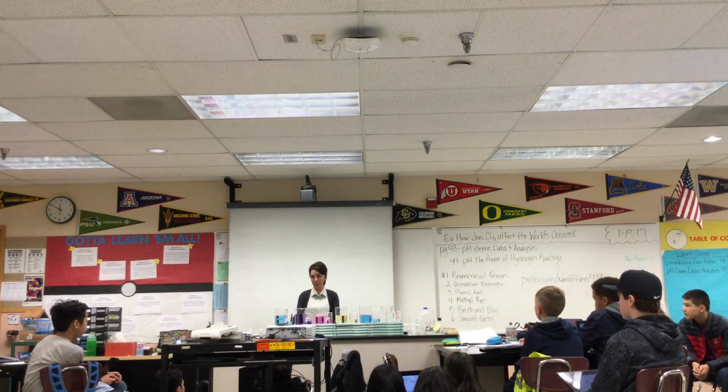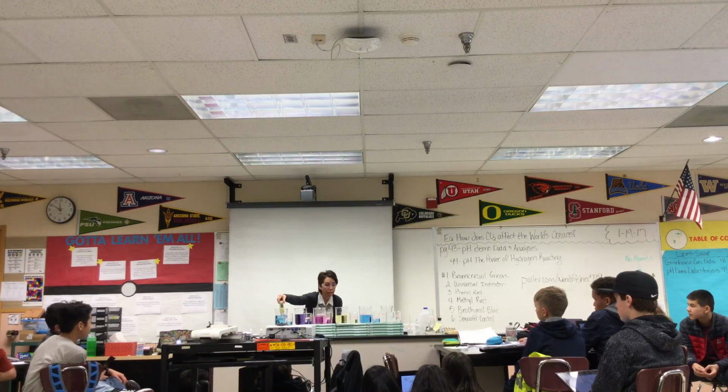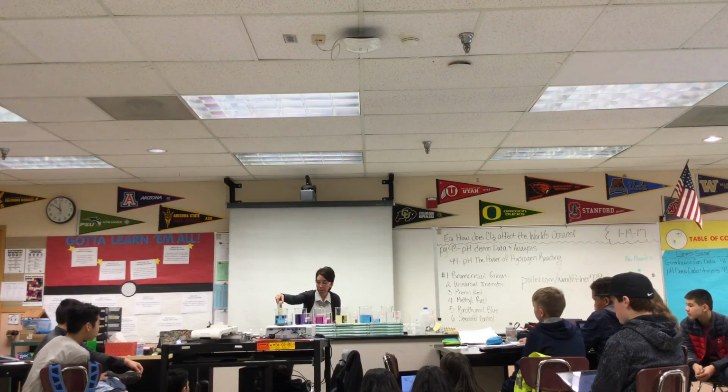How do I know it has to at least be 5.5? Because it's blue. But it could be higher than 5.5. 5.5 is as high as it indicates. What do you got down there, Daniel? Can you see it? 9.15, right? But it's still blue. It's going down a little bit? Yeah. 8.98. 8.9. It doesn't say 8.9, right? But the highest it can indicate is 5.5, so it can always be higher than that.